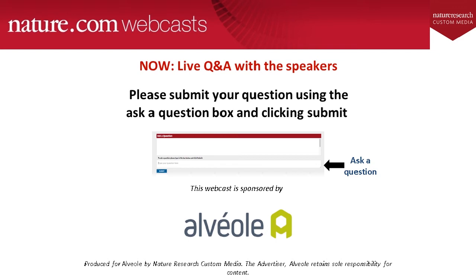Our next question asks, if using this technique with protein samples, do you expect the proteins concentrated on the carbon film instead of inside the holes? Oh, that's basically the same question. I guess these guys were thinking along similar lines. So in our experience, and maybe I'll add a little bit of information here, because if you are interested in getting your protein in the holes, what you could consider doing is decreasing your blotting time.